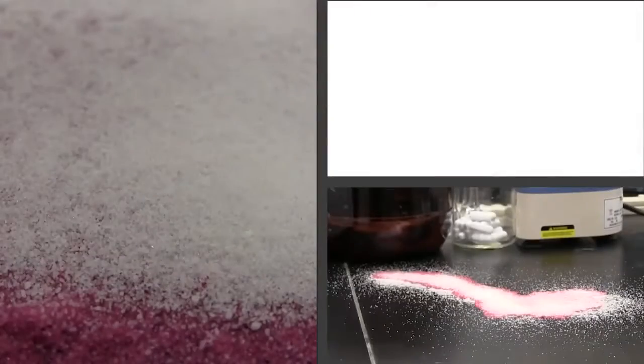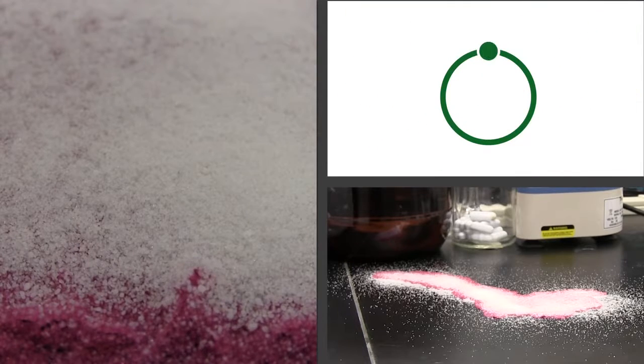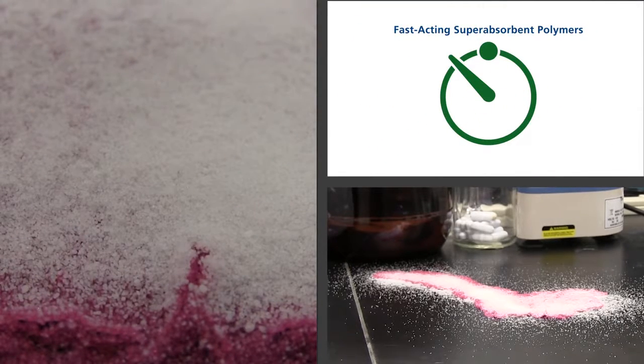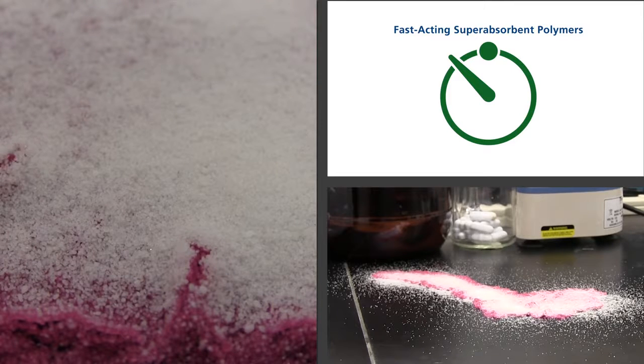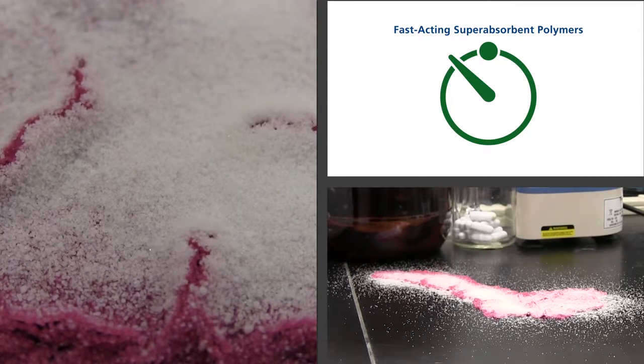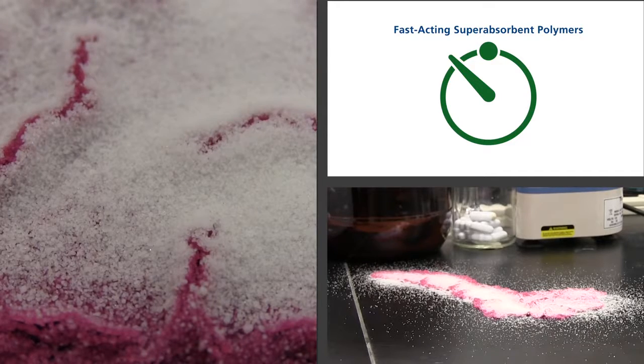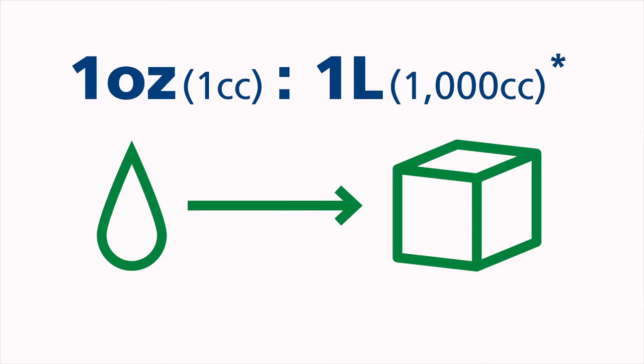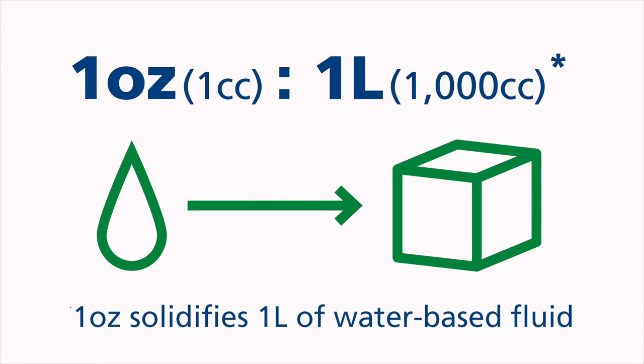One of the most important benefits to choosing Green Z is that it contains fast-acting super absorbent polymers. These are high quality granules that have the unique ability to hold large amounts of absorbed water-based fluid, even against pressure. Just one ounce of Green Z can solidify over one liter of fluid.